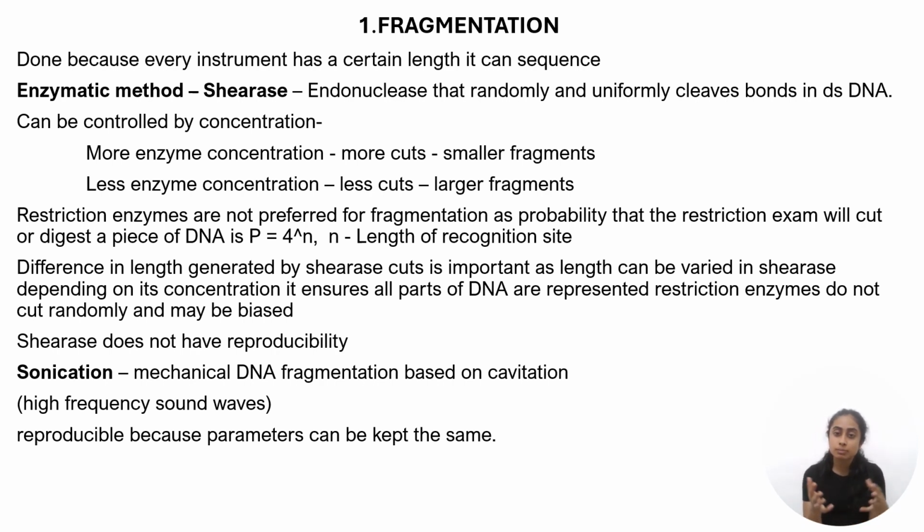To remember this, a simple analogy is imagine you are cutting a carrot. The more cuts that you make, the smaller pieces that you get. And if you make less number of cuts, you'll get bigger pieces of the carrot. Shearase works in a similar way, but for DNA.